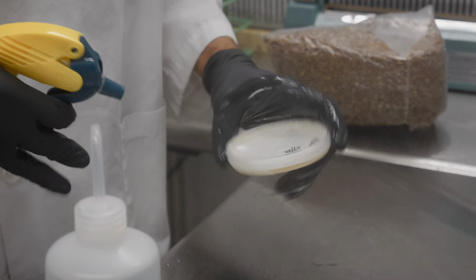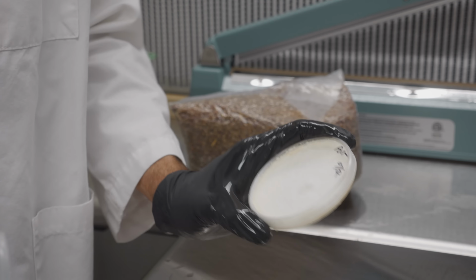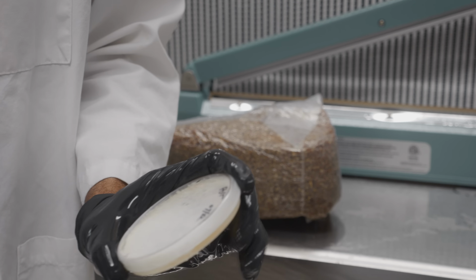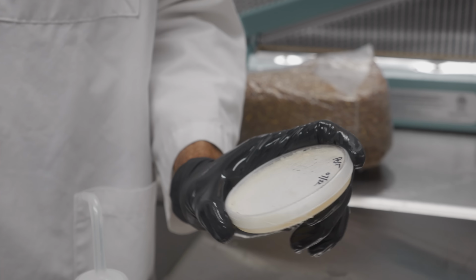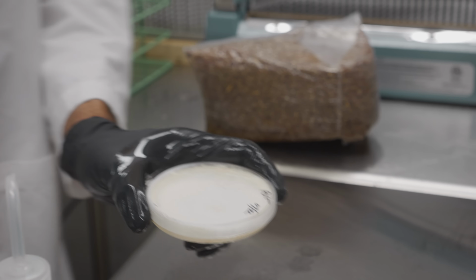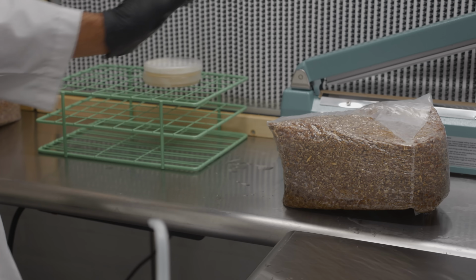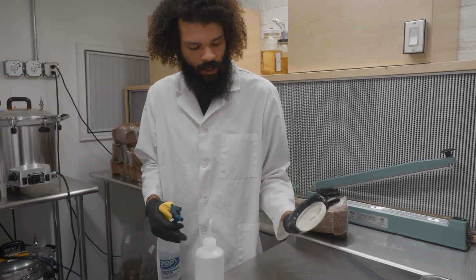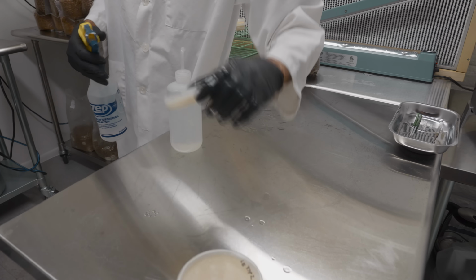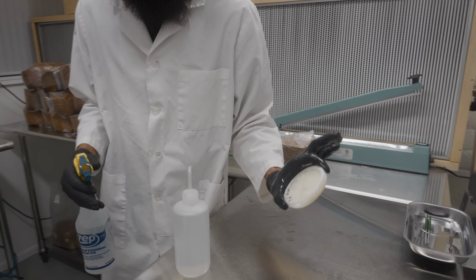We also have a blue-green oyster, which is a really beautiful oyster mushroom. Oyster mushrooms in general typically take over your agar plates within a matter of days. This petri dish is only about a week old, so we can see some nice growth. A couple of shiitake strains, nice shiitake right there. We have another oyster variety.